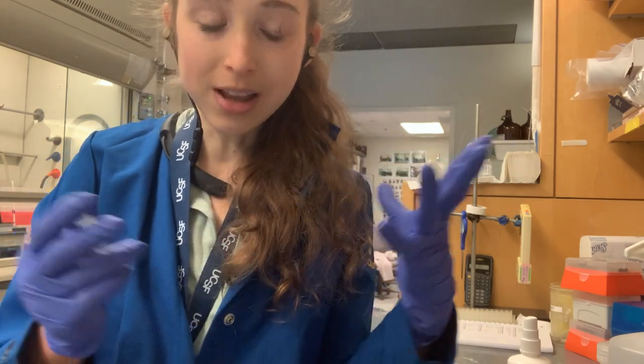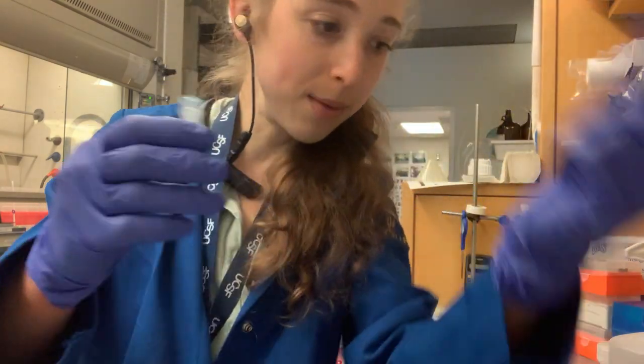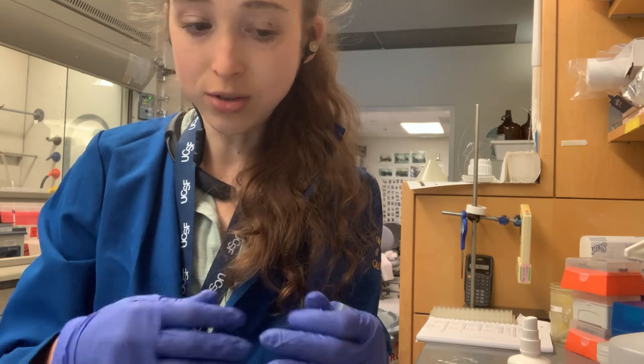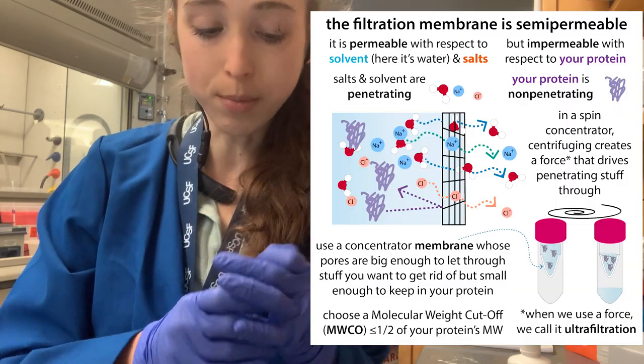Sometimes if you're doing a lot of these at once, you might take two up, pour them off, and whatever — so it's easy to get mixed up. Be really, really careful. The same applies to centrifuge concentrators for your proteins.